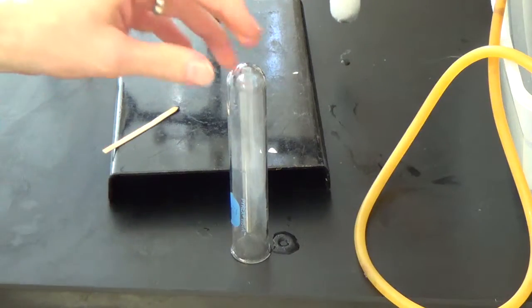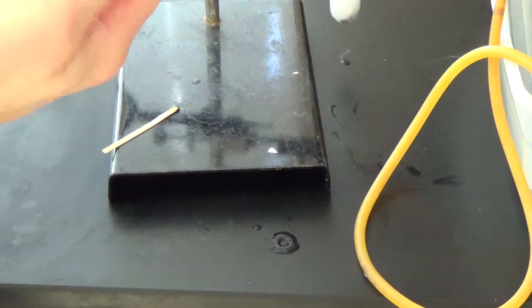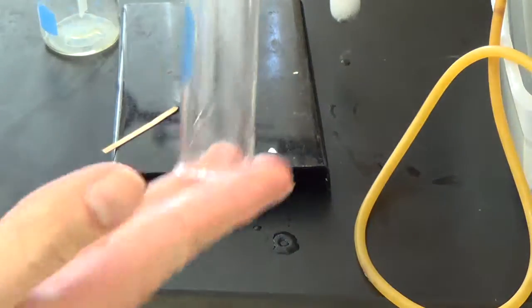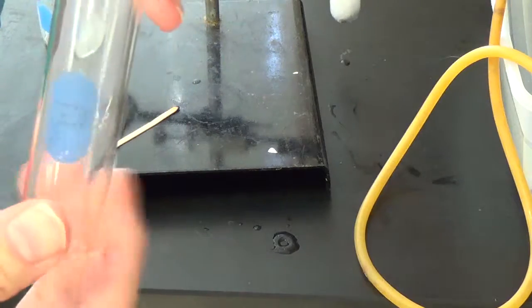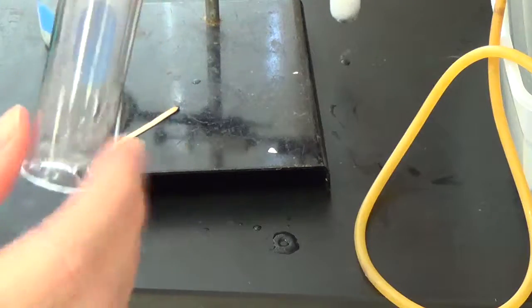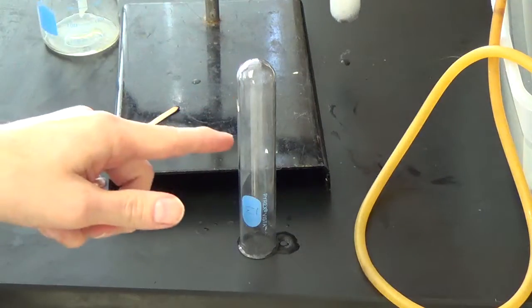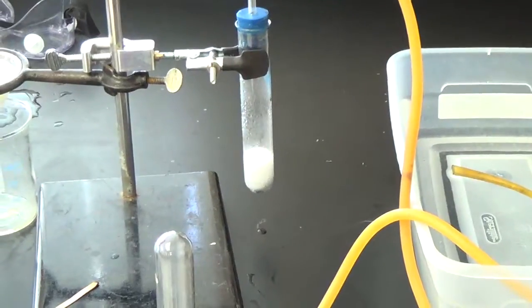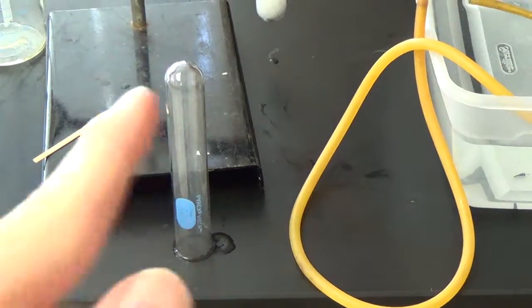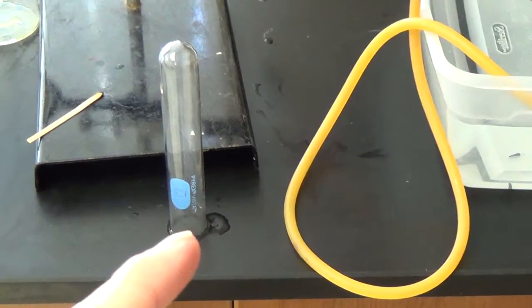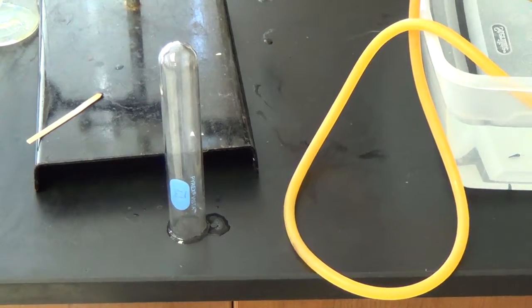That combination will tell me what kind of gas was in there. That is Reaction 7. I had a particular gas in there that I burned. That means oxygen from the air went inside and burned with it. I also want to point out what do you notice inside that test tube now? Do you see those droplets of water? They weren't there before I burned it. So the combustion reaction must have also produced some product that would make these little droplets of water. Reaction 6 was the magnesium with the hydrochloric acid in the first big test tube. And then me combusting the gas, which was the product from that reaction. So the product of that reaction is the reactant in this reaction with some oxygen because I burned it. Oxygen came from the air and made some water. That's Reaction 7.